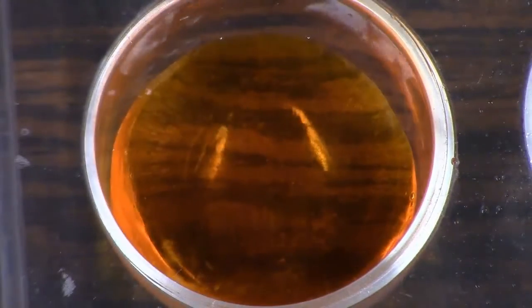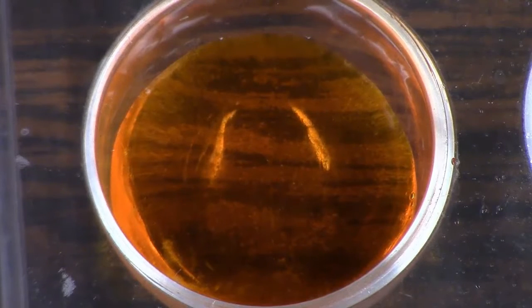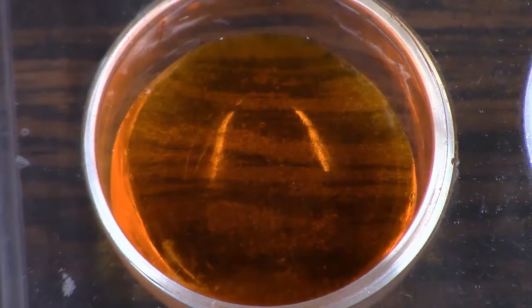So a solution of hydrochloric acid was added to the potassium chromate. Observe what happens. So you probably are seeing quite a difference compared to the beginning. Is that physical or chemical change? You've been provided with the products of this reaction because it's more complex than the others, but you should still be able to identify the type of reaction.